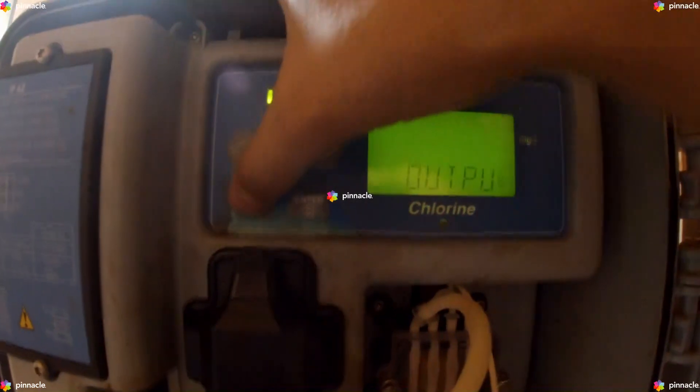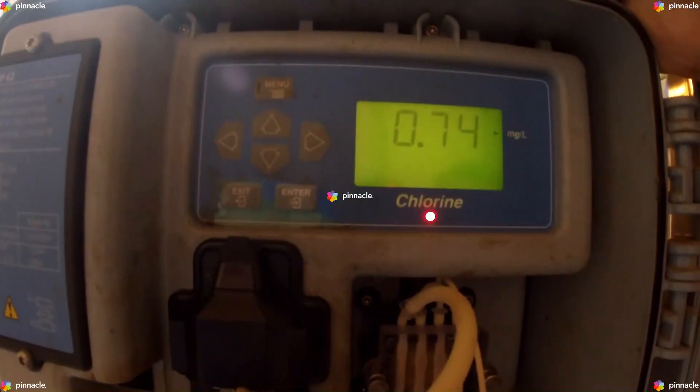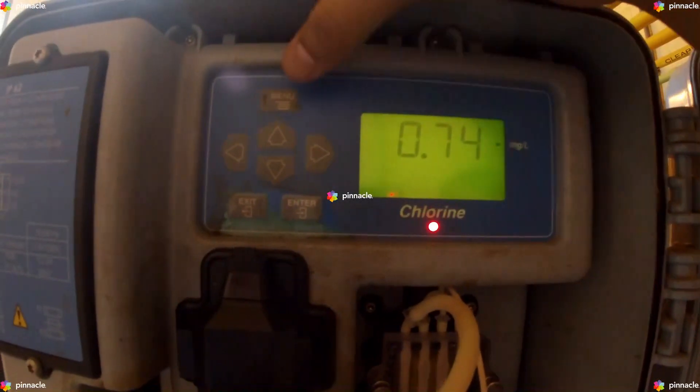We will exit this menu by clicking on Exit, and this takes us directly to our home page. Now once again we will click on Menu.